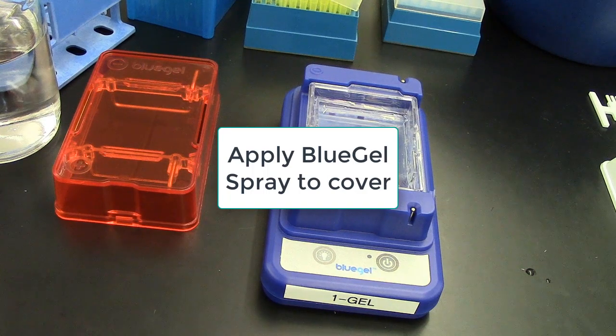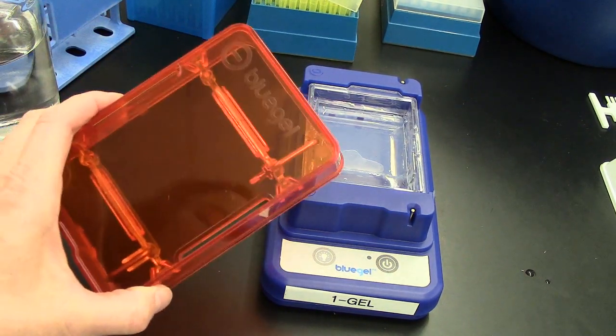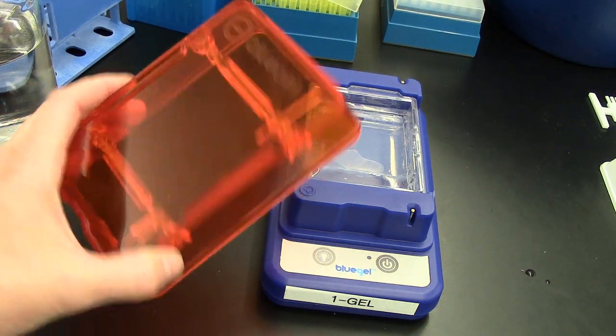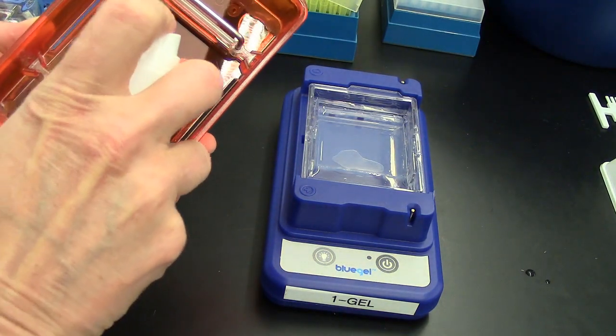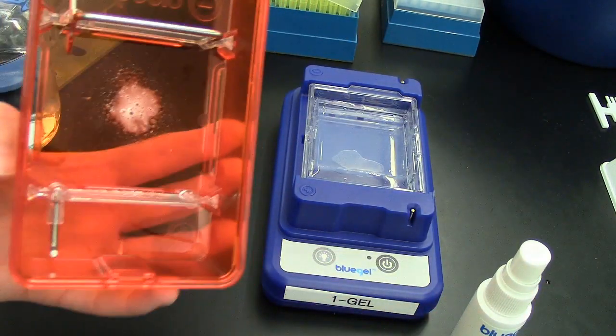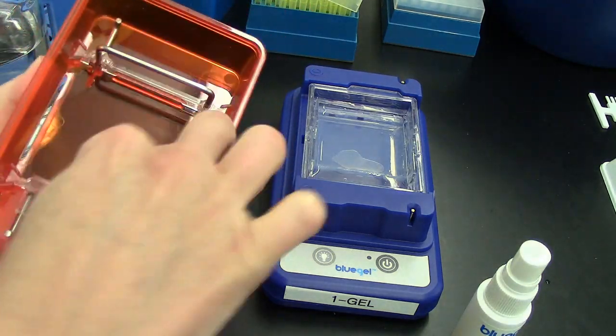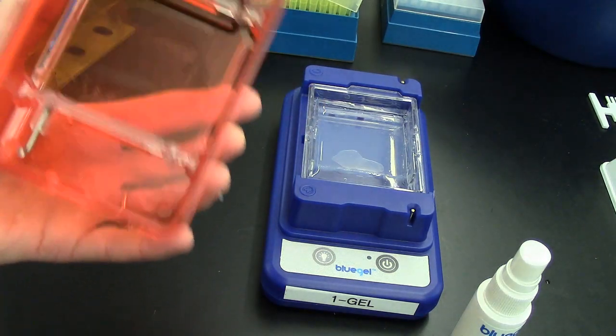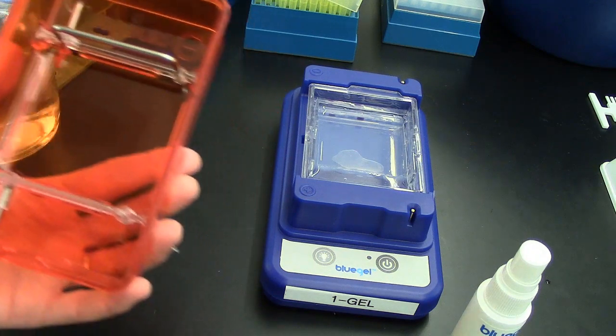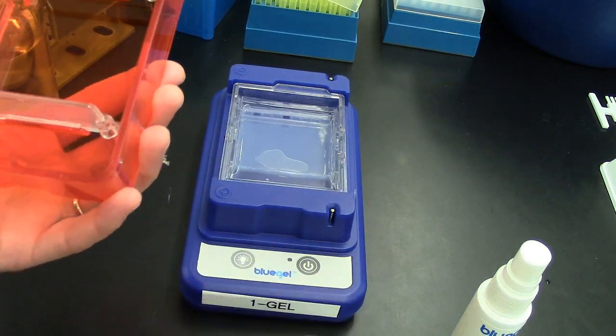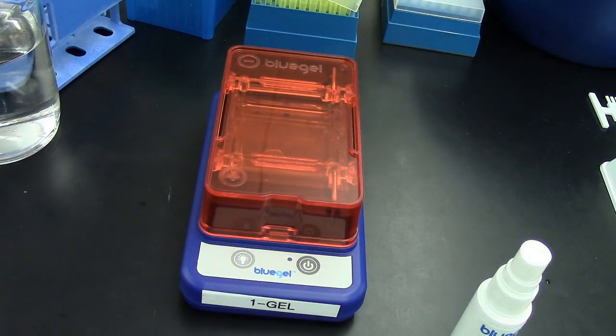To do the final assembly on the electrophoresis chamber, take the cover and reduce the amount of condensation that will occur during the run by taking this blue gel spray and putting one spray between those two electrodes. Take your blue cloth and rub it so it equally spreads on there. Then cover your gel with the cap.